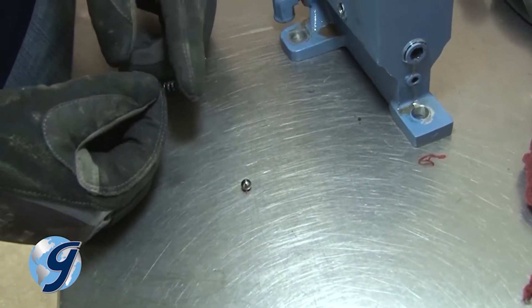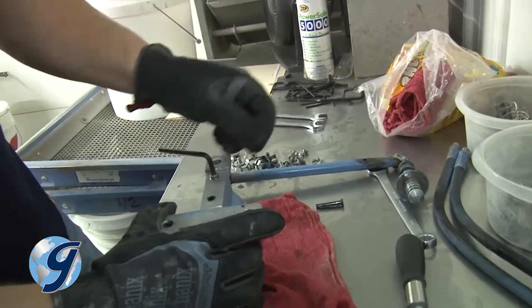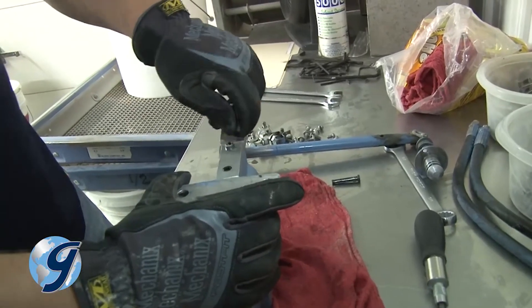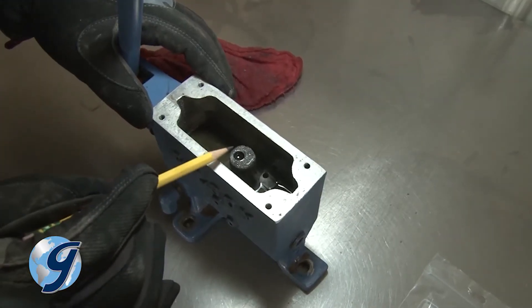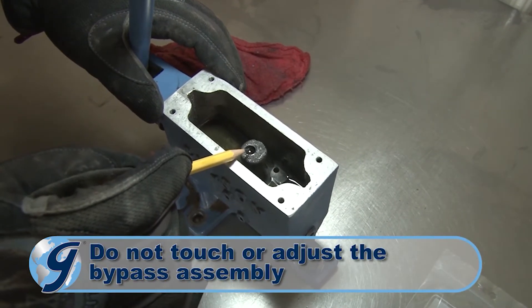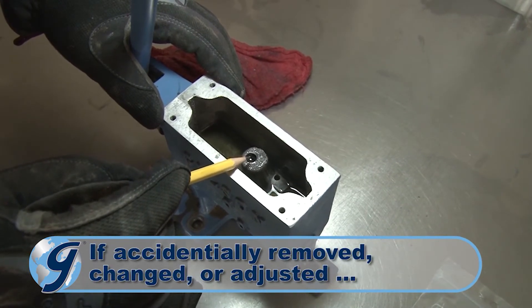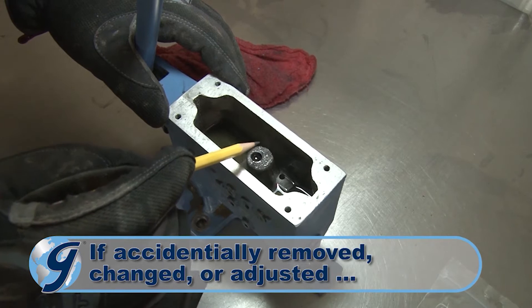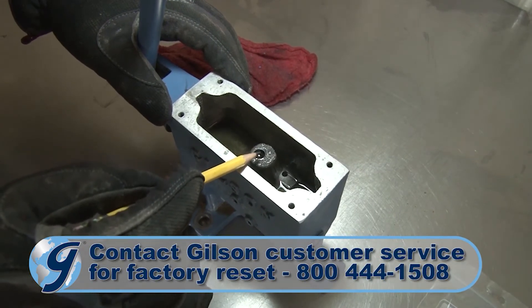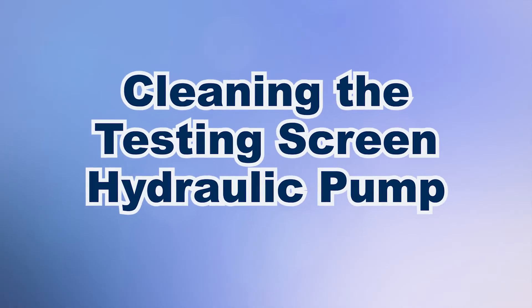Finally, remove any remaining plugs located in close proximity to the pressure release, pressure check, and intake check plugs. It is important that you do not touch the bypass assembly. This is set at the factory using special fixtures and should not be changed or adjusted. If you have accidentally removed or adjusted the bypass assembly, please contact Gilson Technical Support for instructions on how to return the pump to Gilson to reset the bypass assembly to factory settings.